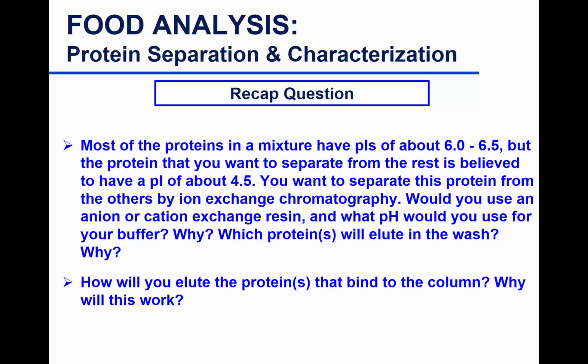Remember, anion exchange is exchanging anions with your stationary phase. That means negatively charged. So what do I pick? What's easier? You can pick either, but what's easier for you? The easier is anion exchange. Why? Because then the positively charged molecules will not interact with the column. They will just go with your void volume. They will not interact, and then your protein of interest will latch on to your stationary phase.